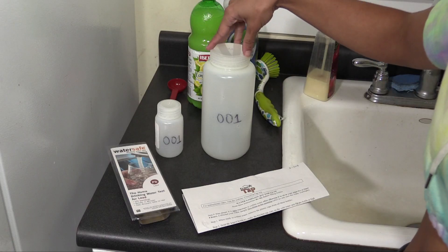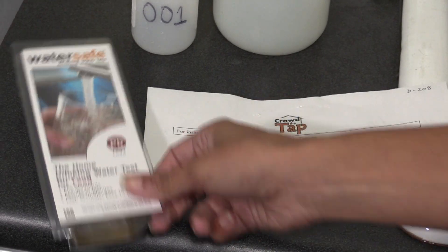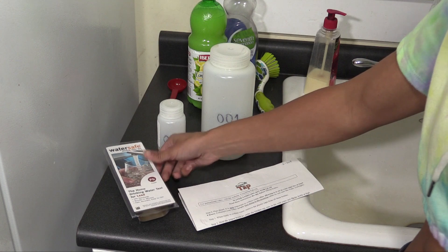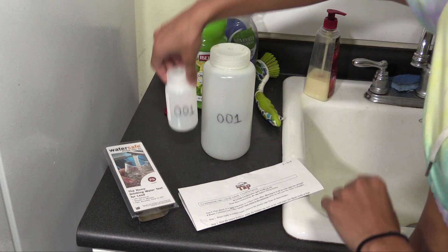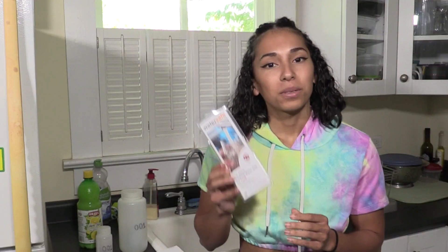In the kit you received, you'll find a large bottle, a small bottle, your kit ID slip, and the water-safe lead test. Write your name on the small bottle and fill out the kit ID slip. But don't open that lead test just yet.